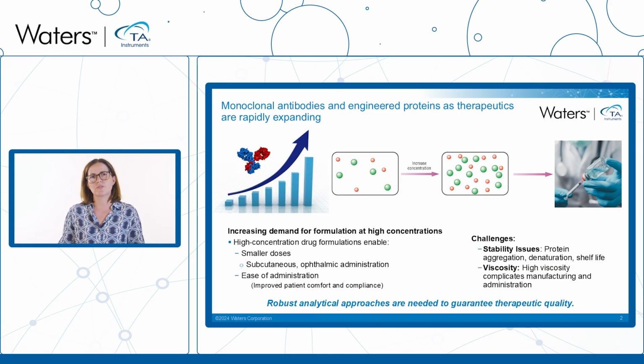This is especially true for antibody formulations for subcutaneous and ocular drug delivery, where high concentrations are required to achieve the desired therapeutic effect. However, developing high concentration drugs is not simple, and there are several challenges such as stability issues and high viscosity.